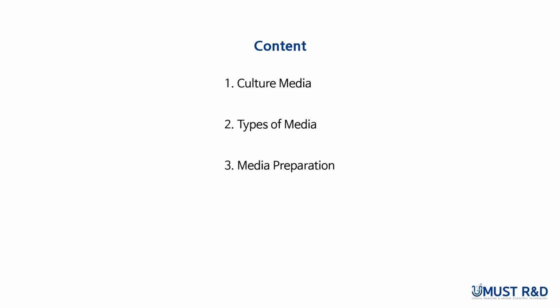In this lecture, we will first define what culture media are. Then, we will learn about the different types of culture media and how to prepare them for microbial cultivation.